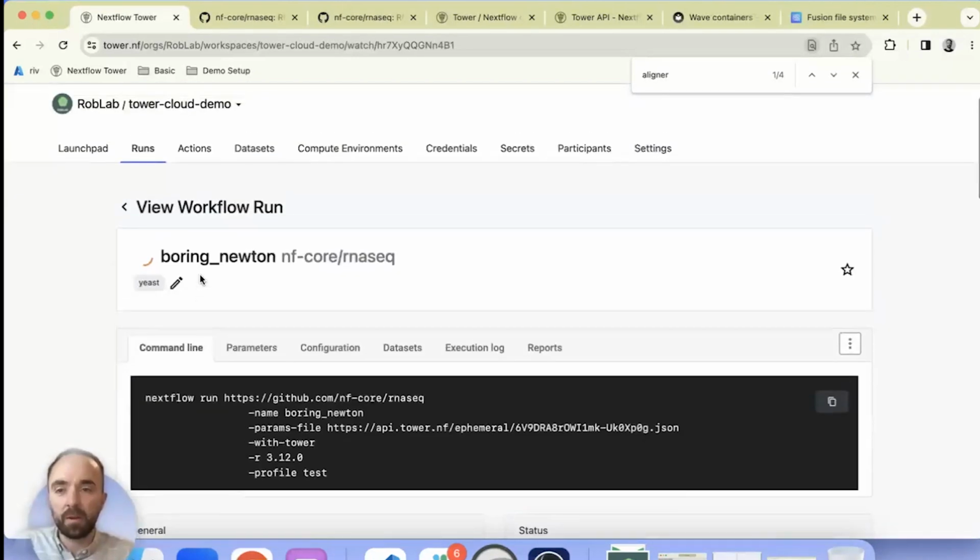I'm just going to wait for that RNA-seq run to start and have a quick look at the questions in the chat. I think most of the questions we'll get to in the Q&A at the end. Yeah, perfect. We'll tackle most of those questions at the end.